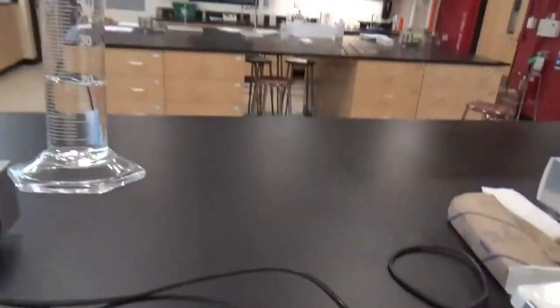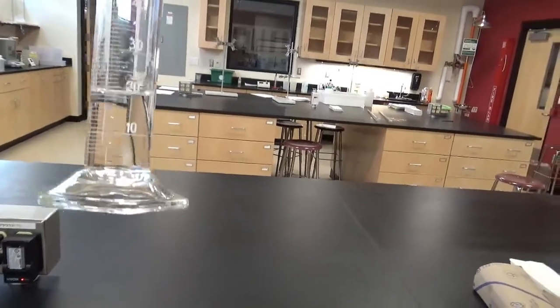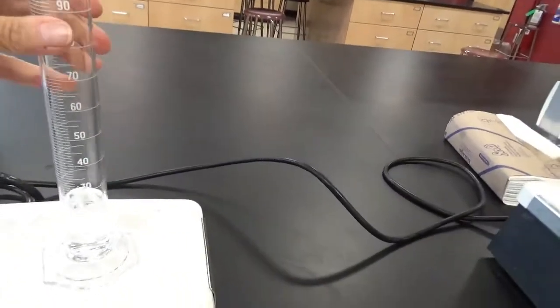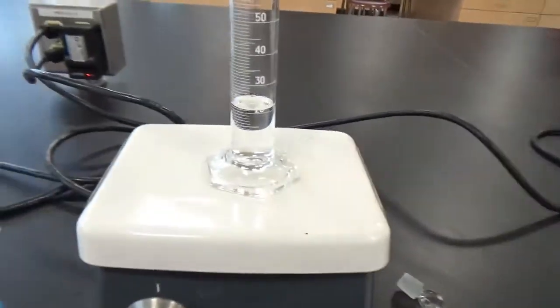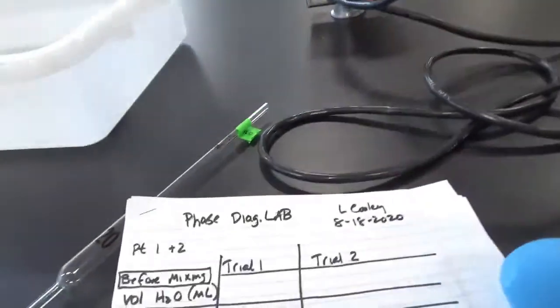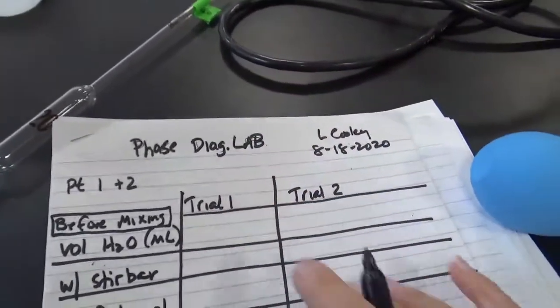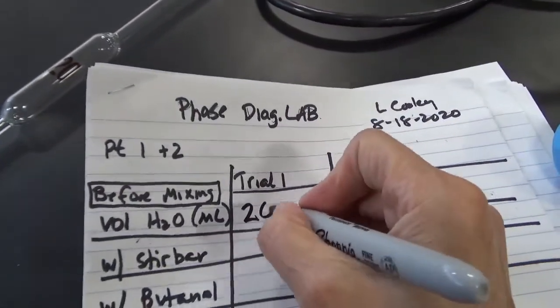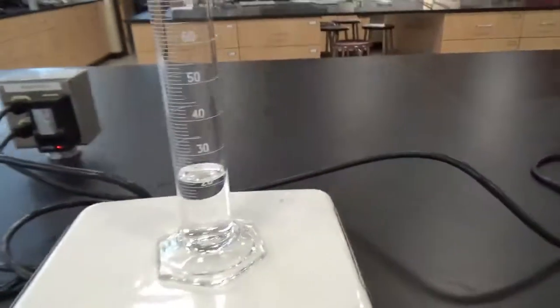All right, so I just got through pipetting 20 milliliters of water into this graduated cylinder, and when I measure its volume, I find that it's 20.2 milliliters. So I'm going to record that on my data. And now I have to put a stir bar in there.